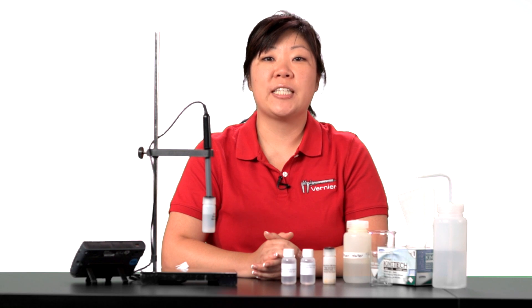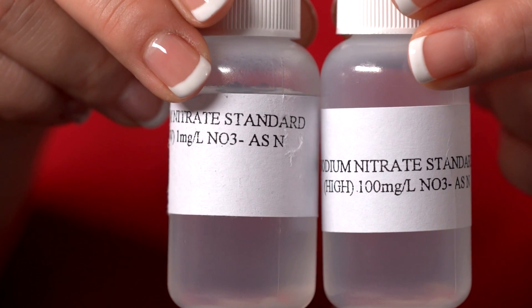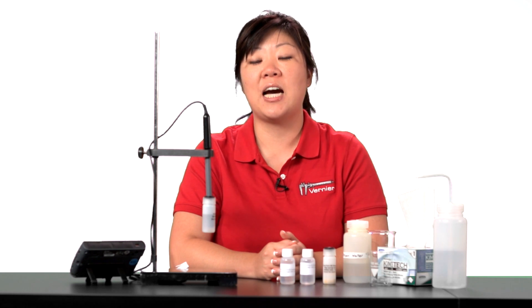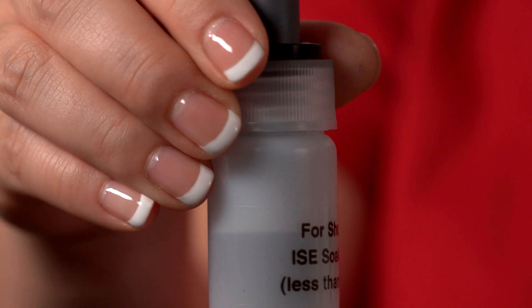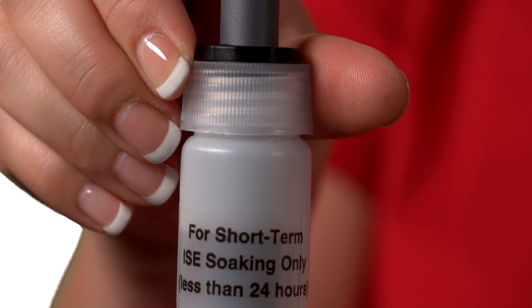Each sensor requires a calibration before use, and a high and low standard are provided with each sensor. To prepare the sensor for calibration, soak the tip in the high standard for at least 30 minutes. This nitrate ISE has been soaking in the high standard — the 100 milligrams per liter — for at least 30 minutes.